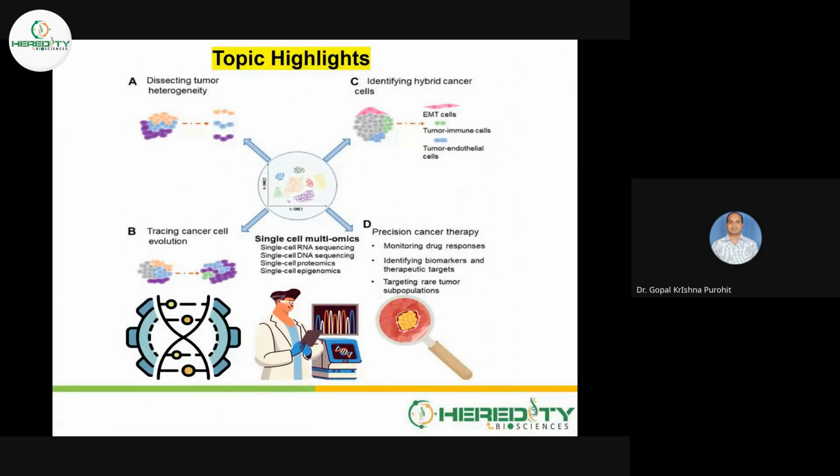To know more about what tumor cellular heterogeneity is: tumor heterogeneity, a defining characteristic of cancer, poses challenges to effective therapy and fuels tumor progression. Examining both inter- and intratumoral heterogeneity not only yields insight into tumor development but also informs the creation of personalized treatments. While previous high-throughput sequencing technologies offered insight into the tumor ecosystem, they lack the resolution to capture a detailed cellular landscape.